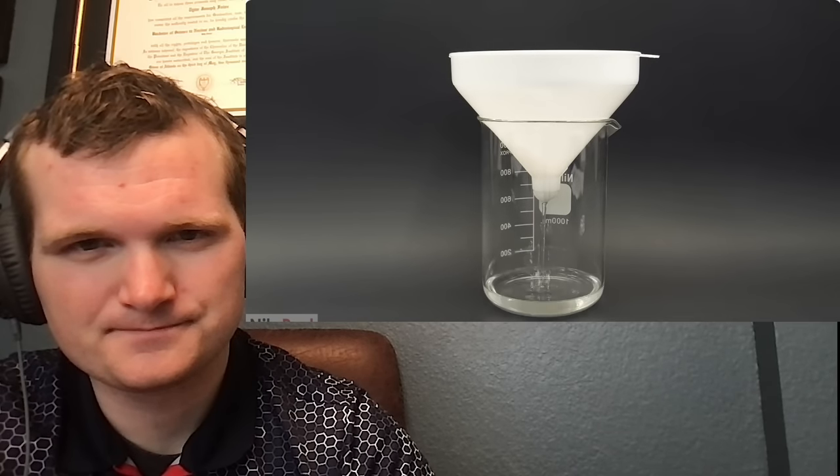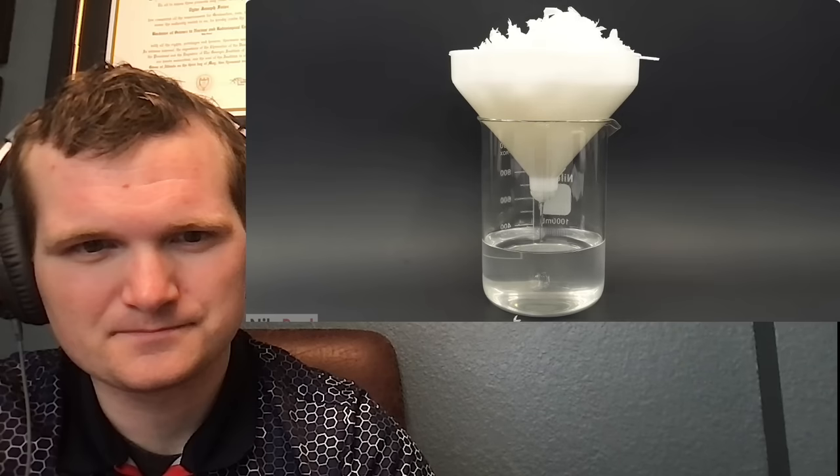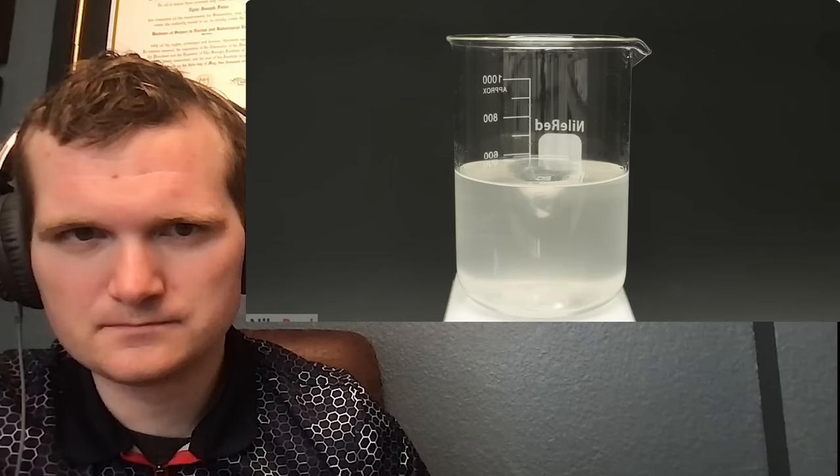I let it boil for an hour, then poured it through a funnel plugged with some cotton to get rid of all the glove pieces. At this point everything I wanted should have been in the alcohol. After this I put it back on the hot plate, dropped in a stir bar, and brought it back to a boil. The goal now was to concentrate it by getting rid of about half of the alcohol, so I left the beaker completely open.